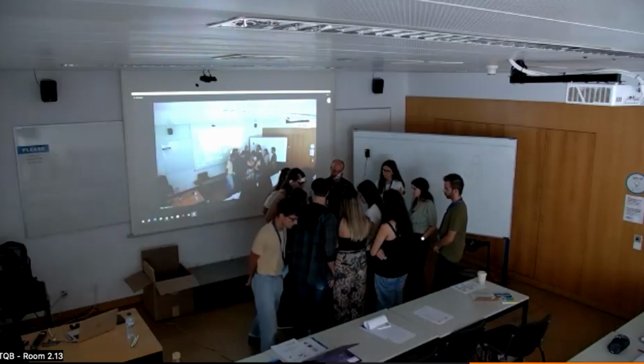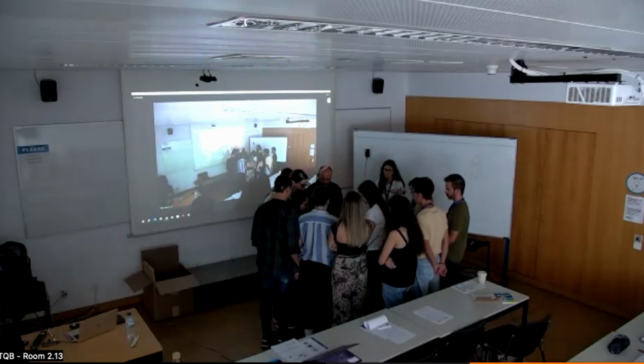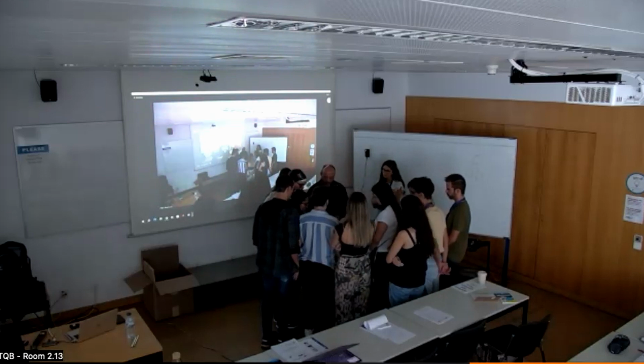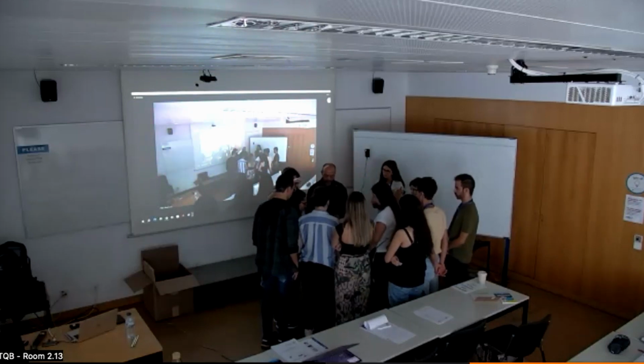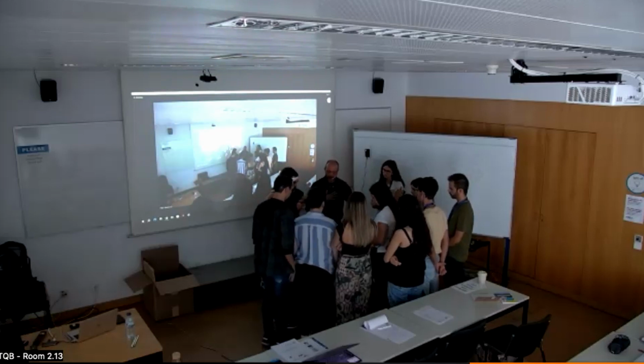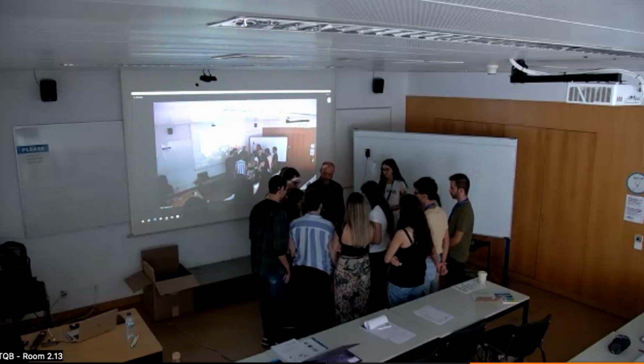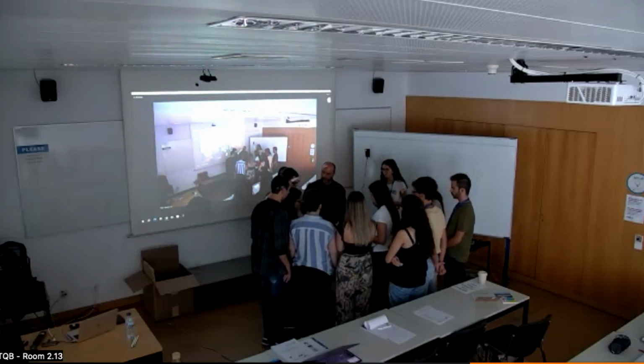Okay, now go back. So I move just enough to not look at the coin anymore. Keeping the position of your back, stay straight, and then move back just enough until the coin disappears from the edges. Are you there? Are you in a position where you just do not see the coin?